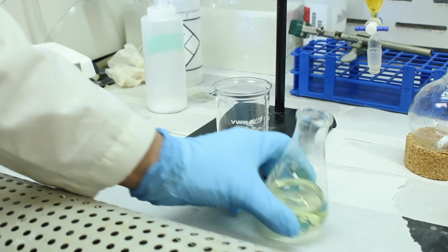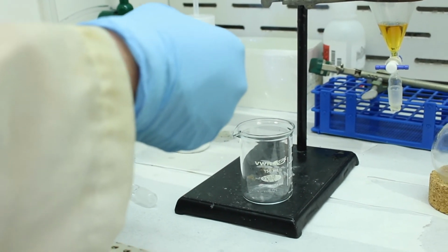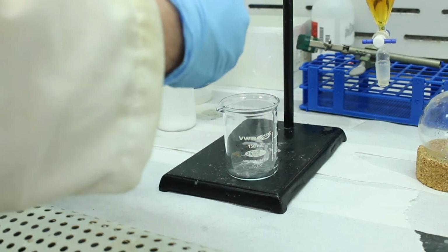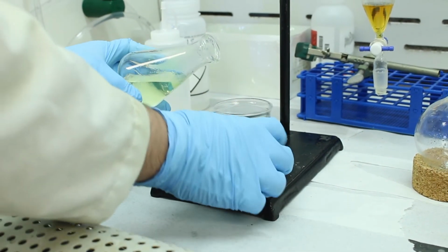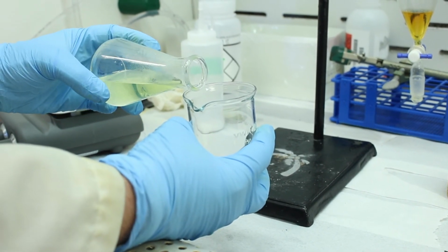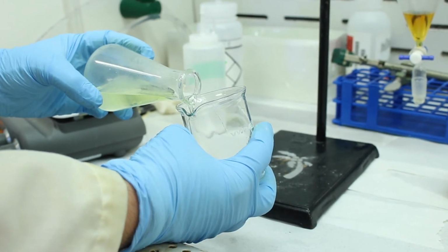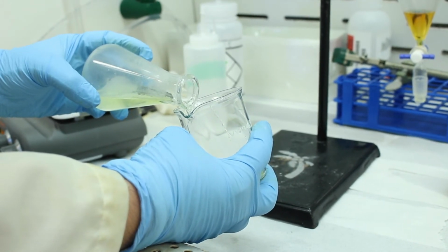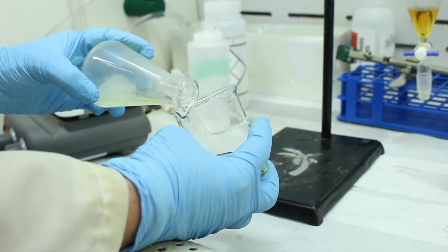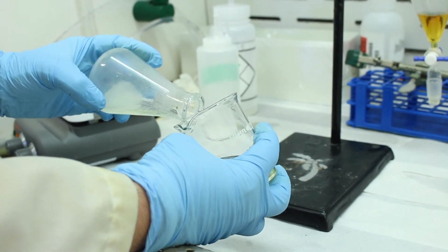Okay, so we have our ether layer, which has been drying. We're going to decant it as carefully as we can into this beaker here, where we can evaporate the ether. So I'm going to do my best not to filter it. You could filter it, but we're short on time, so we're going to try to transfer as much of it as possible without getting any solid. With sodium sulfate, this is not too difficult, but if you use a finer, more powdery drying agent like magnesium sulfate, this can be challenging.